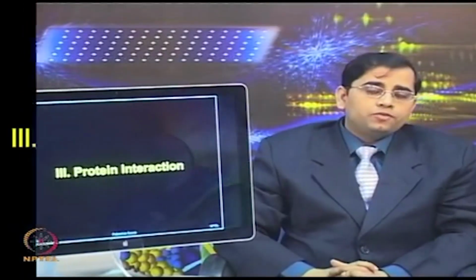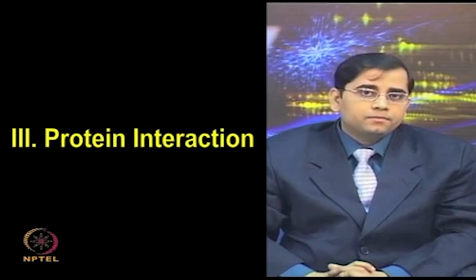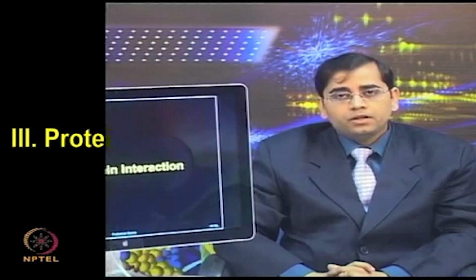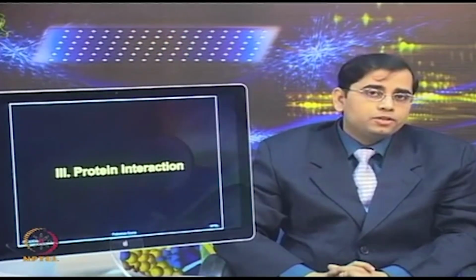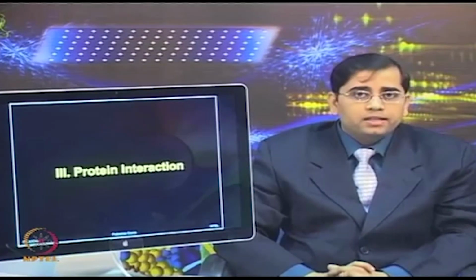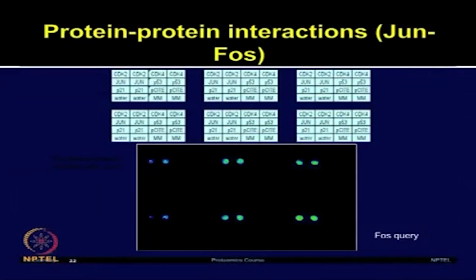So, as you have got a glimpse of different types of applications of protein microarrays such as biomarker discovery and immunological studies, now let us look at another widely used application, protein-protein interactions by using cell-free expression based protein microarrays. In this part of the lecture, I will mainly focus on the nucleic acid programmable protein arrays, how they have been employed to study the protein-protein interactions.